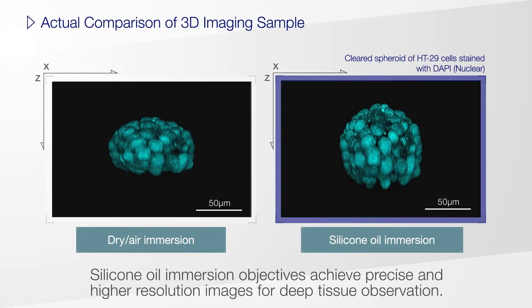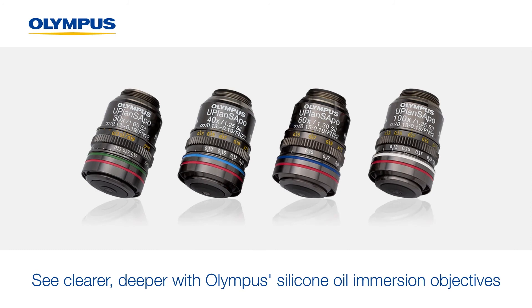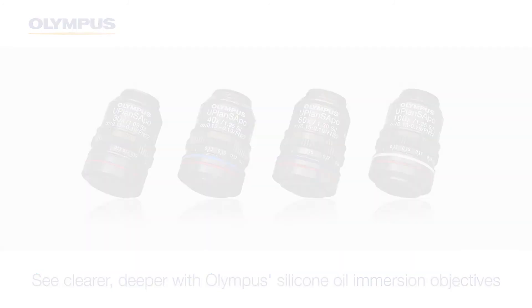Silicone immersion objectives achieve precise, high-resolution images during deep tissue observation, as observed on these HT29 cells images. Our line of Silicone Immersion Objectives enables you to choose the one that best suits your application.